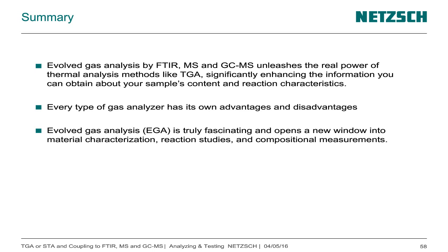Okay, it's not necessary to do a run before. If I get a sample and do a measurement here in the lab, I normally have some information about the sample. Then I choose around 1 milligram. If I know a little bit about the sample, I make an injection every 2 minutes to see what is happening during the evolution. This is the quasi-continuous mode, and this is the first information which I have.